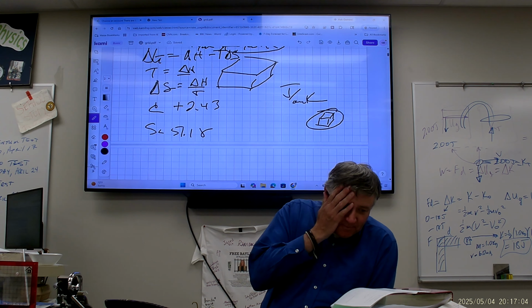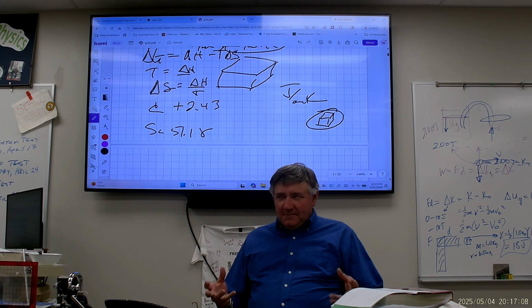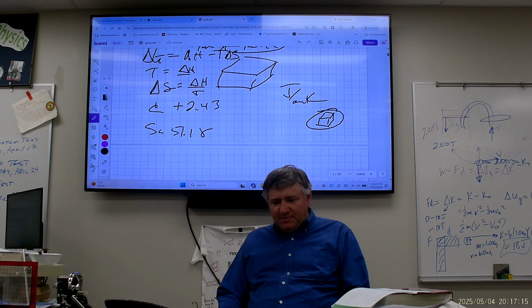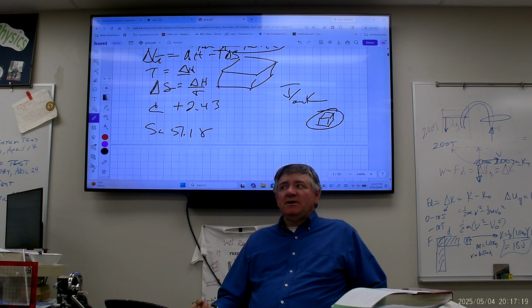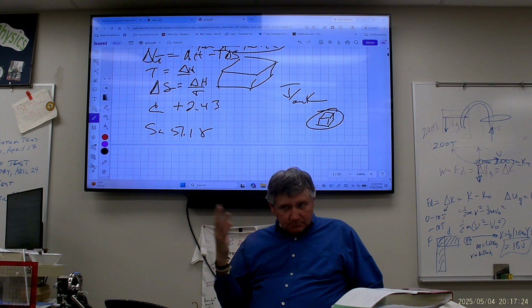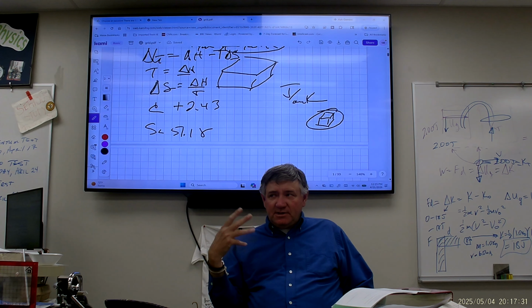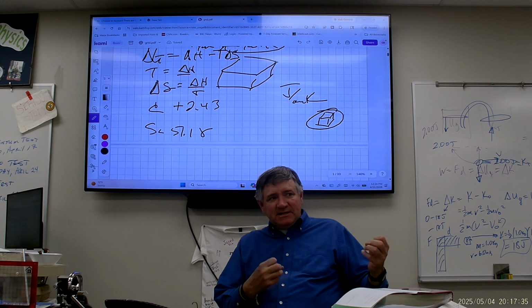Explain the purpose of this lab. So, the good and bad thing about this whole concept of Gibbs free energy and entropy is, again, that we don't have probes to measure any of them. Okay? We don't. We got nothing. Okay? So, the reason that I wrote this lab and picked out these 4 reactions is so that you can see how it actually plays out.